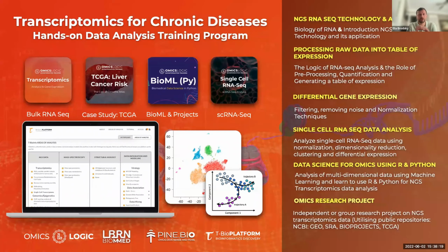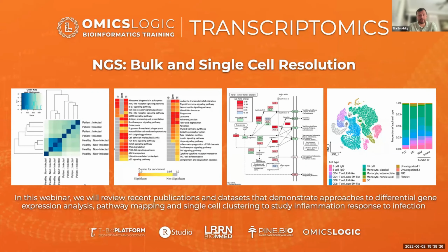So the second program is going to be more focused on transcriptomic data analysis, or RNA-seq. And we're going to talk about bulk RNA-seq, when you extract your RNA from the whole tissue and analyze levels of gene expression and compare them between different groups or create different contrasts. But we'll also talk about single cell RNA-seq, when you extract RNA with a barcode that can make it specific to a cell. And so this is an exciting field with a lot of new methods that are becoming available.